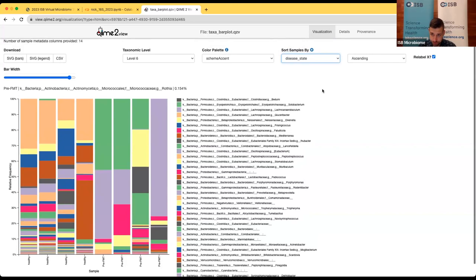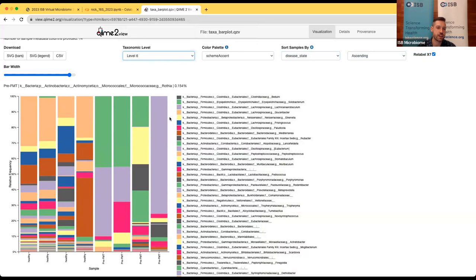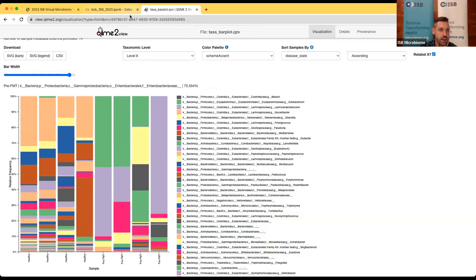We can also sort by other sample metadata and look at other taxonomic levels. If you scroll over any part of the bar plot you can see the associated taxonomic assignment at the top of the plot as well as the percent relative abundance of that taxon within a sample.